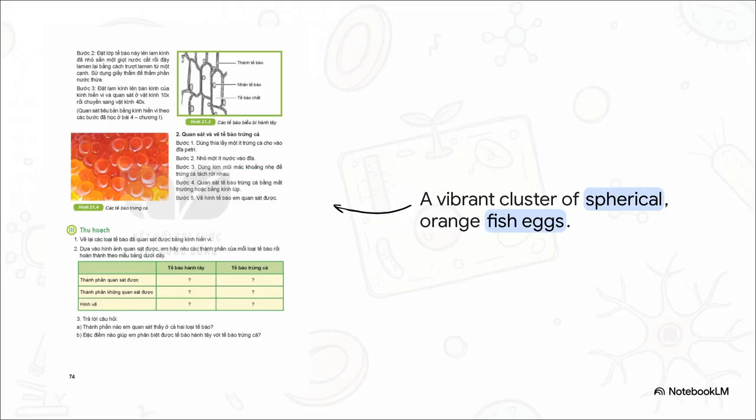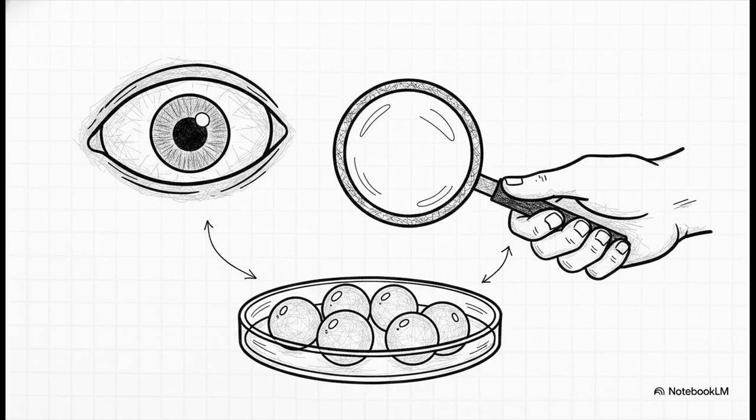If you've ever seen fish eggs, you know they naturally want to stick together in this protective, jelly-like clump. But look how vibrant, translucent, and perfectly spherical they are once we start separating them out. And here's the absolute kicker. We are totally bypassing the 40x microscope for this. Remember our question earlier about seeing cells with the naked eye? Well, here is your answer.